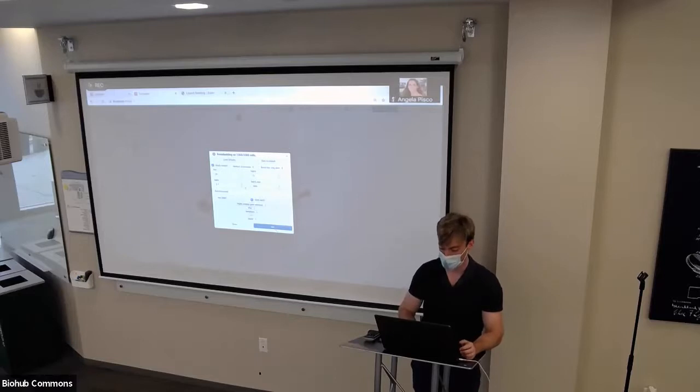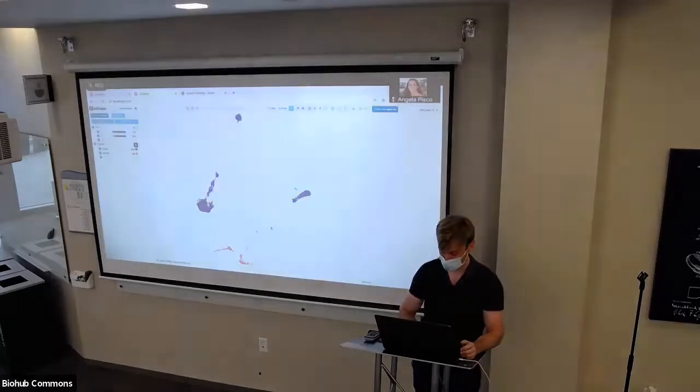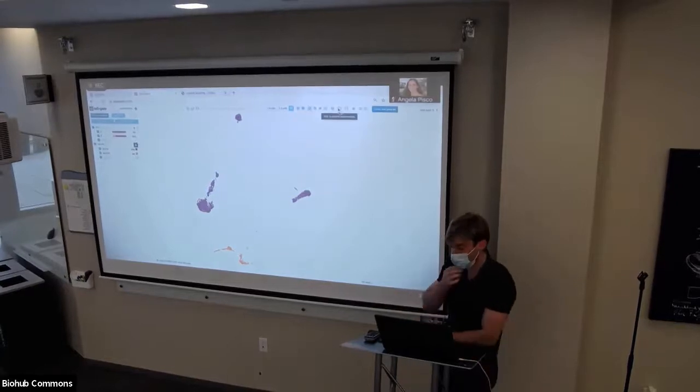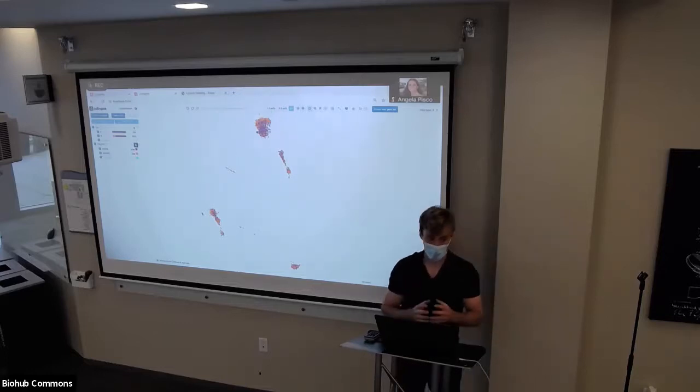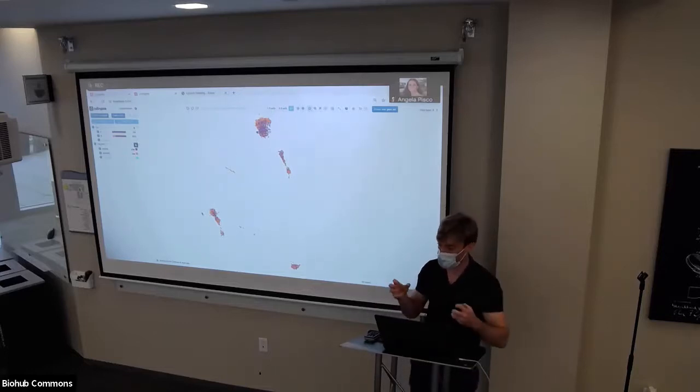We have scale data on, we're doing batch correction. We chose the batch key. If you don't have any batch key selected, you won't actually be able to exit the screen. So we'll hit run. It's doing its thing. And with luck, you'll see that the batches are now properly corrected for. And voila. Now you have an embedding with orange and purple cells overlapping each other because they ended up being the same cell type in the end. And now you just removed the technical artifacts that were keeping them separate.